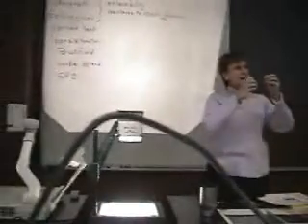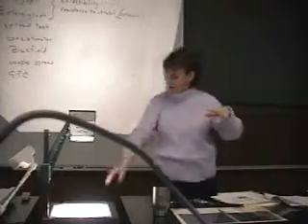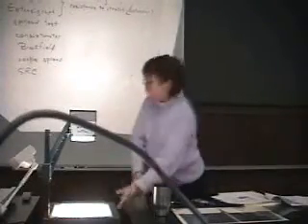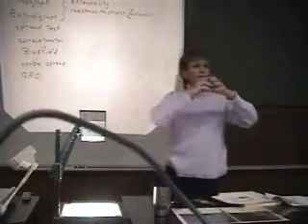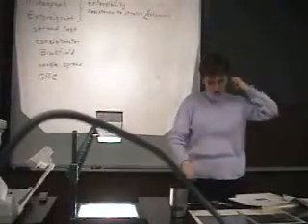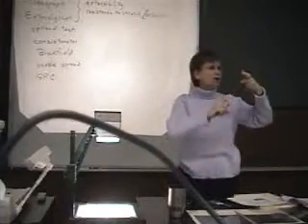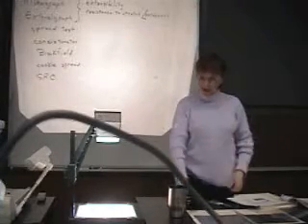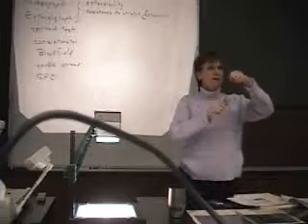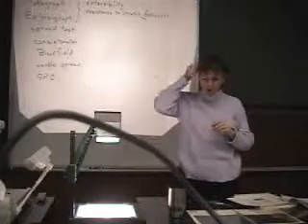So with both of these, you're taking a dough piece after mixing and looking at its characteristics. With the alveograph, you blow the bubble. With extensograph, you stretch the cylinder. But you're looking at extensibility, how far that dough piece will stretch or expand before it's ruptured, and resistance to extension, how tight that dough is, kind of a strength kind of thing.